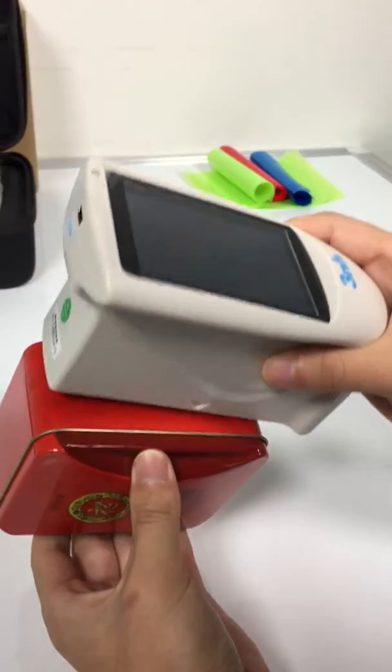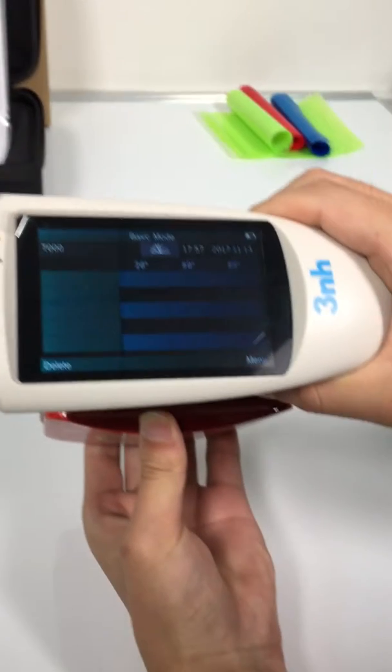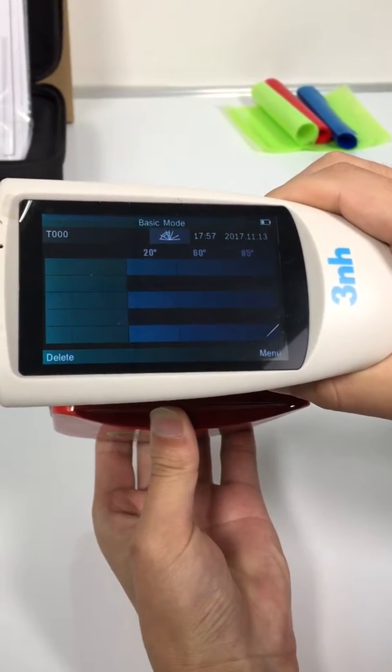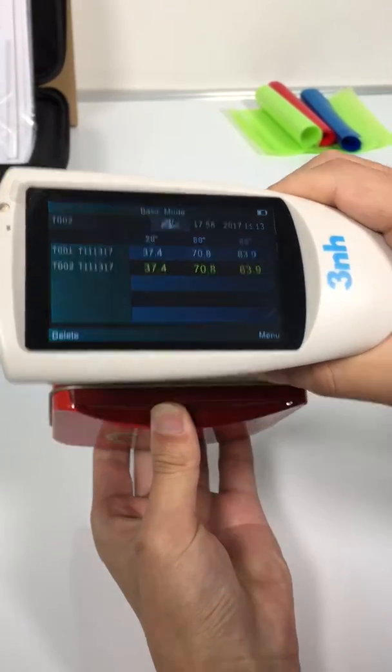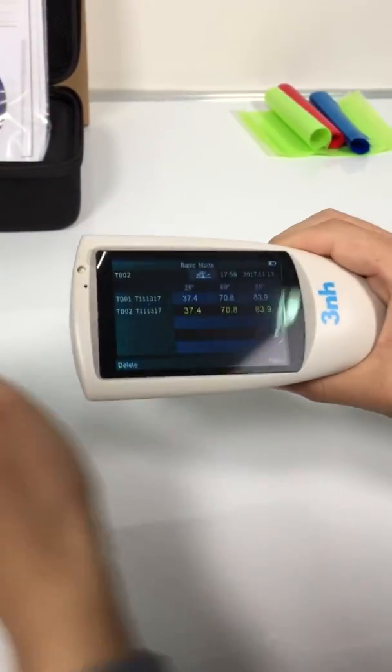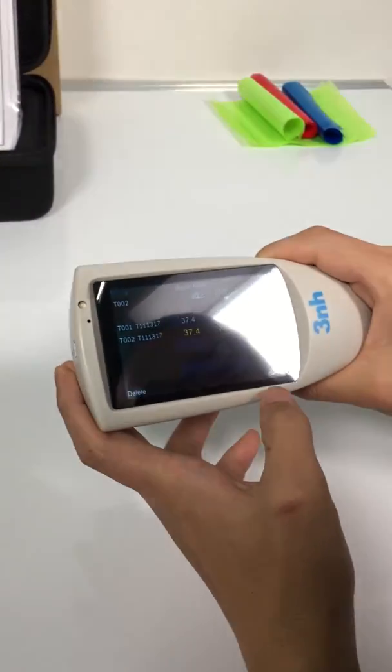We measure a sample like this. Let's check the menu interface.